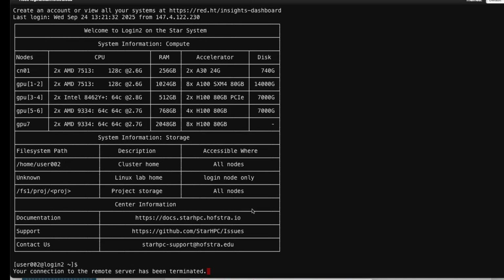Okay, so I want to start by talking about navigating the file system on our computers. Because in order to do almost anything, you need to be able to point tools towards, here's the file that I want you to run this analysis on. Here's where I want you to put the output of that analysis. And so all computers are organized into this directory structure, right? They're made up of different folders. On your home computer, it might be like, oh, you have a desktop folder and a downloads folder. And so you're going to need to know the structure of the computer you're working on to be able to use it efficiently. So we're going to explore and navigate this file system as our first start in Bash.